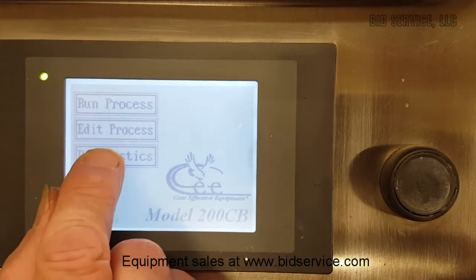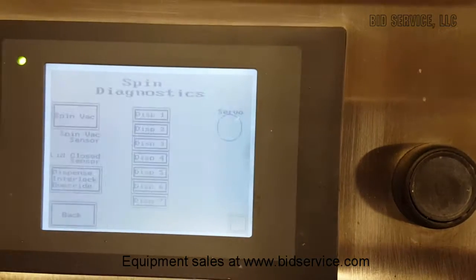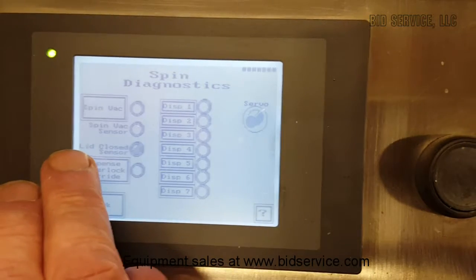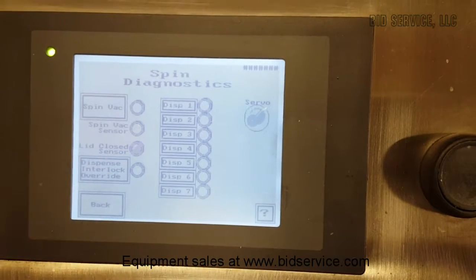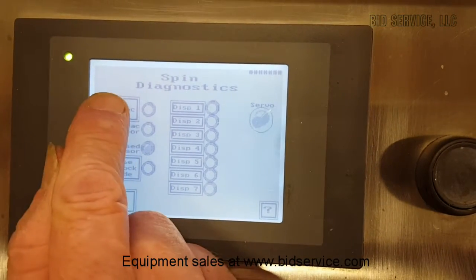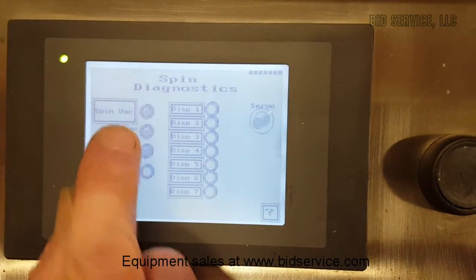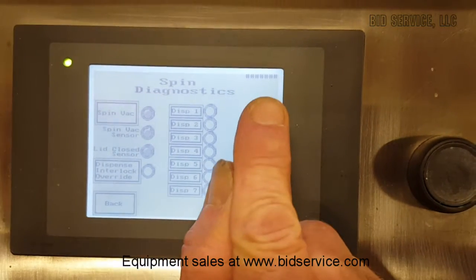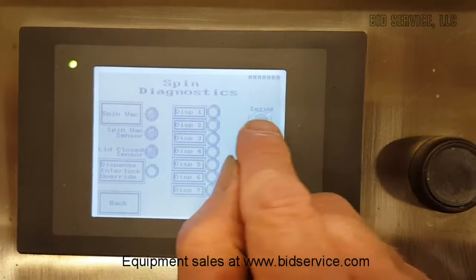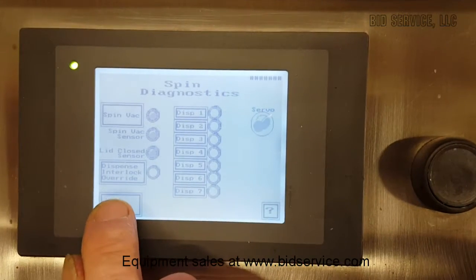Finally, the last one is diagnostics. That's really nice and simple. We'll look at the spin diagnostics — it'll tell you the different sensors. Here it shows the lid closed sensor; if I open the lid you'll see it go on and off. If I want to put the spin on, the vacuum is on and the spin sensor is on, and I can actually spin the chuck. And we can go back.